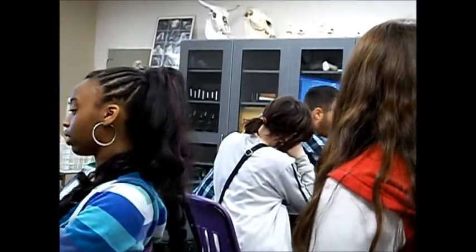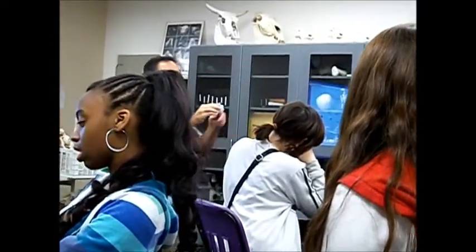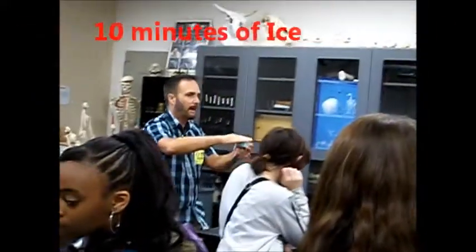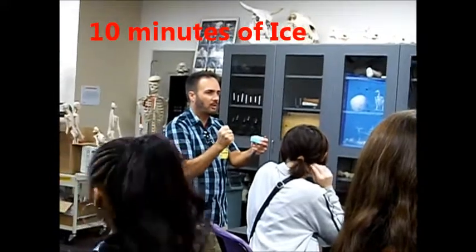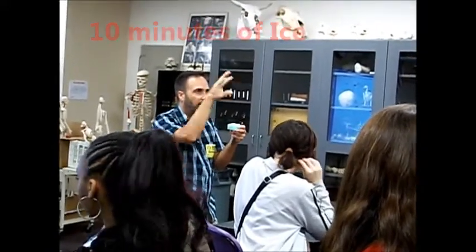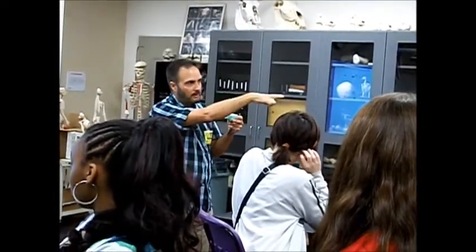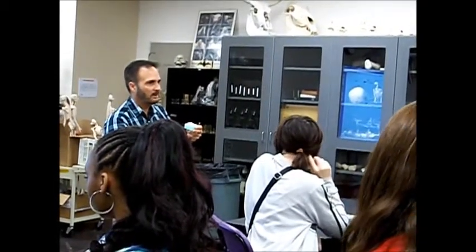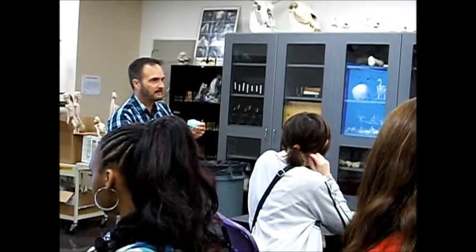But the problem with this is, if you just do that, the DNA won't go into the cells. So what you're going to do is they have to sit on ice for about 10 minutes and get good and cold. So they're sitting there shivering like this in their little salty water. The DNA is floating around out here, sitting there. And then you're going to walk them over to that water bath. And this is where it's very important. You have to have something so you can time it. You all have something you can time it, like your phone or something that has a stopwatch?